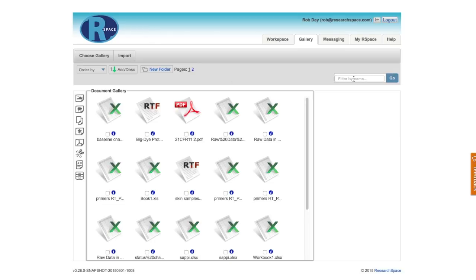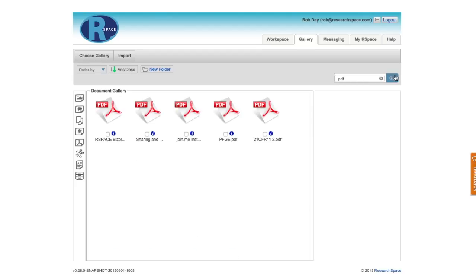But a better way to find files here is to add some filters. I can, for example, say that I'd only like to see my PDF files, or I could say that I'd only like to see my XLS files.